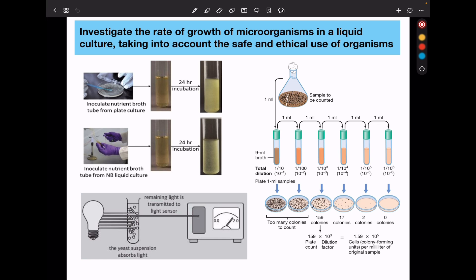When using a colorimeter, you need to fill a sterile cuvette with glucose solution similar in concentration to the one used in the culture — this is about the culture medium. Place this in the colorimeter as a blank to set the absorbance to zero. This could be kept in the refrigerator after use. Then periodically take samples from the culture solution, mix appropriately, transfer to a cuvette, and place that cuvette in the colorimeter. Measure the absorbance and record the results in a suitable table. Repeat this for at least 5 different times over the next 12 hours during the culture.